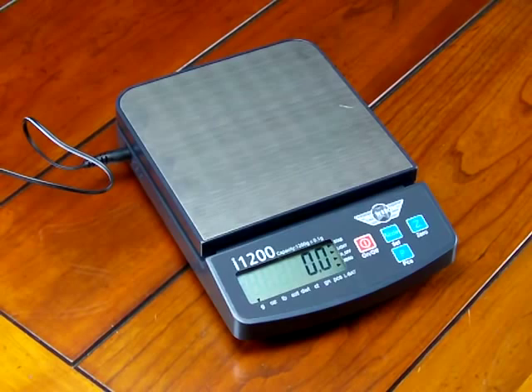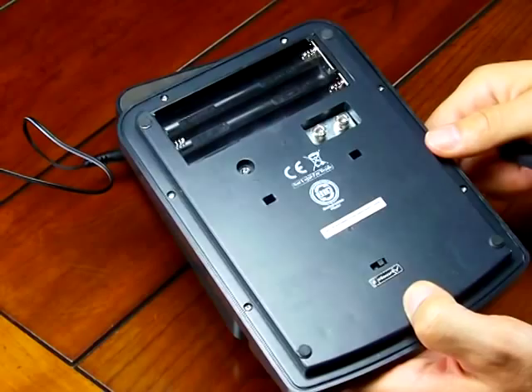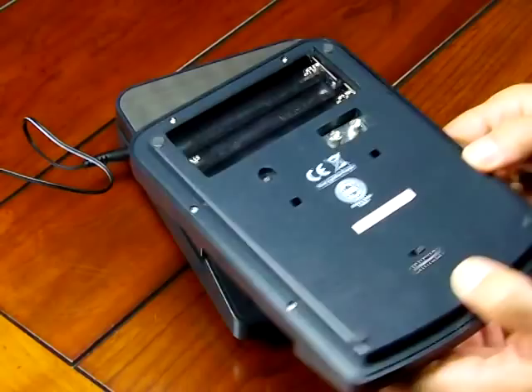The MyWay i1200 is an extremely affordable scale in its price category. If you look at all the features the scale offers, it's tough to beat. The scale comes with the AC adapter standard and can also operate off of six AA batteries, though the batteries you have to supply yourself — they do not come with the scale.